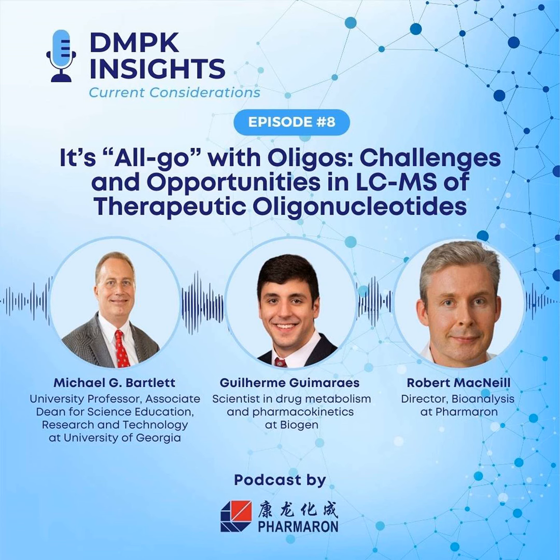Yeah, I think this is a big question in the field of mass spectrometry, and it's not just limited to oligonucleotides. But again, with oligos, there really are not a lot of direct head-to-head comparisons of the two approaches in the literature. But from what I've seen so far from looking at other types of molecules, it's actually a lot closer than I would have expected.